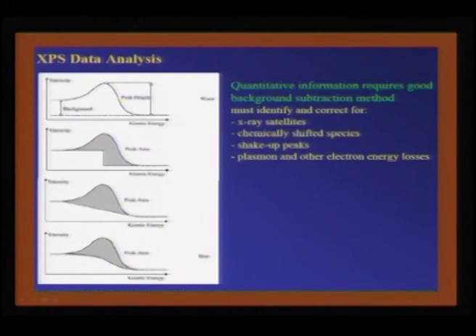carefully. Now, we can try to use the peak area analysis in this way, or we can just draw a baseline this way and try to analyze, but what is actually expected is an optimization of your baseline which has to be in this form. Now there are several softwares which can help us in adjusting the baseline correction, so that the area under this peak can be mapped to quantify the amount of this oxidation state that is present. Therefore, the peak analysis or the deconvoluted peaks need to be analyzed with proper precision.